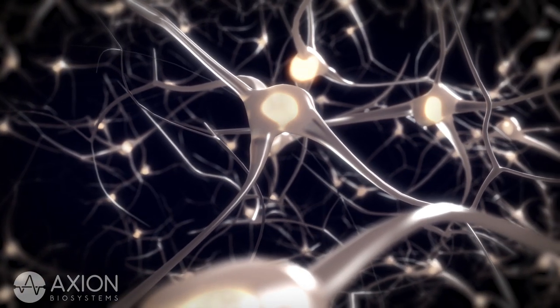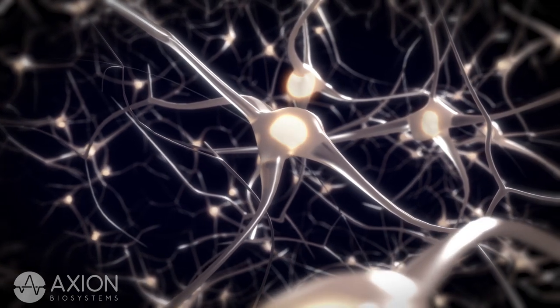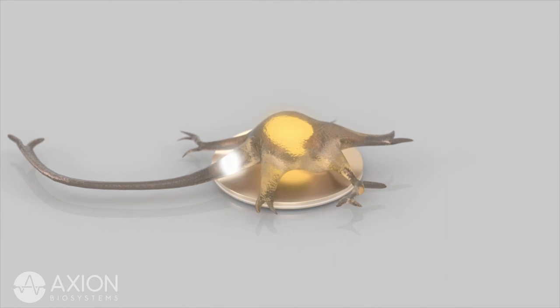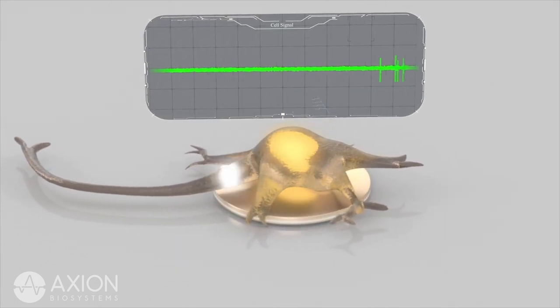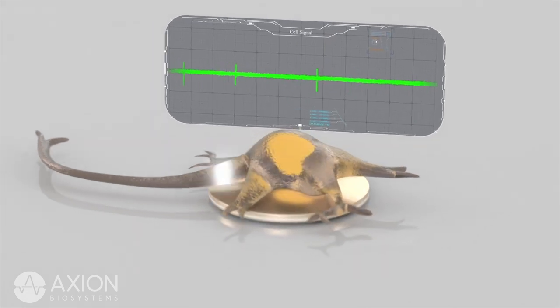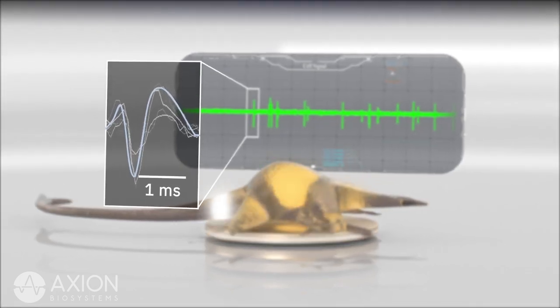Neurons form spontaneous networks as they branch out and communicate across synapses. MEA electrodes are sensitive enough to detect the activity of individual neurons. The signal shown here represents the voltage over time from a single electrode. Each time the neuron above fires an action potential, a spike appears in the signal.